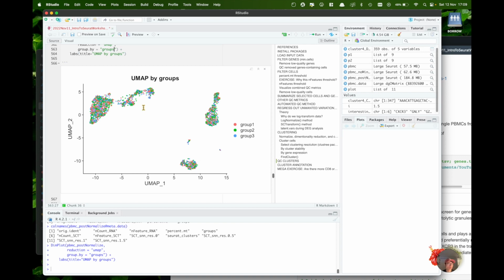Based on this variable alone, you can just merge all of your data instead of having to integrate by group, for example.